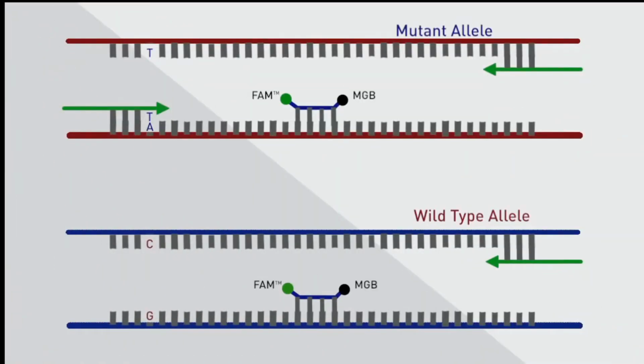An allele-specific MGB blocker oligonucleotide is designed to bind specifically to the wild-type allele. The role of this blocker is to compete with the mutant allele-specific primer and inhibit its binding to the wild-type allele. This blocker suppresses non-specific amplification of the wild-type allele and improves the specificity of the reaction.